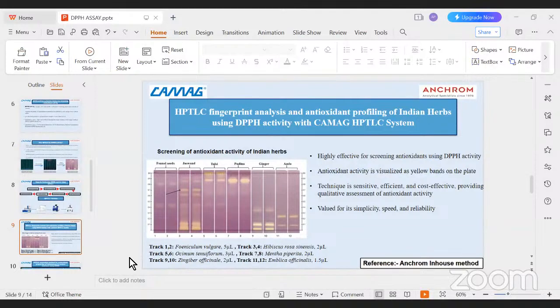And one more thing, as I told you regarding the scanning of the tracks, it just gives an idea, because with these color spots, during the second scan the area may change because the reaction has happened. But it will definitely give you an idea. After that, you have to go for UV spectroscopy quantification by other techniques.